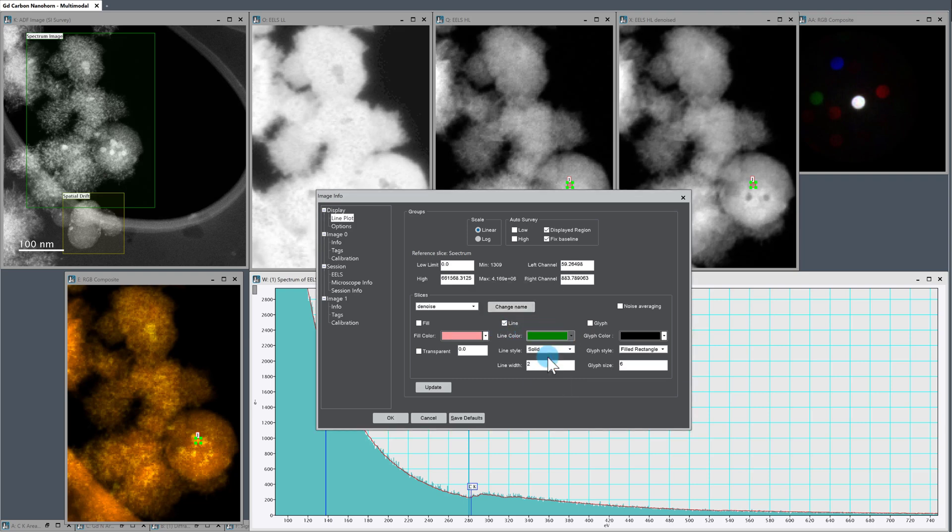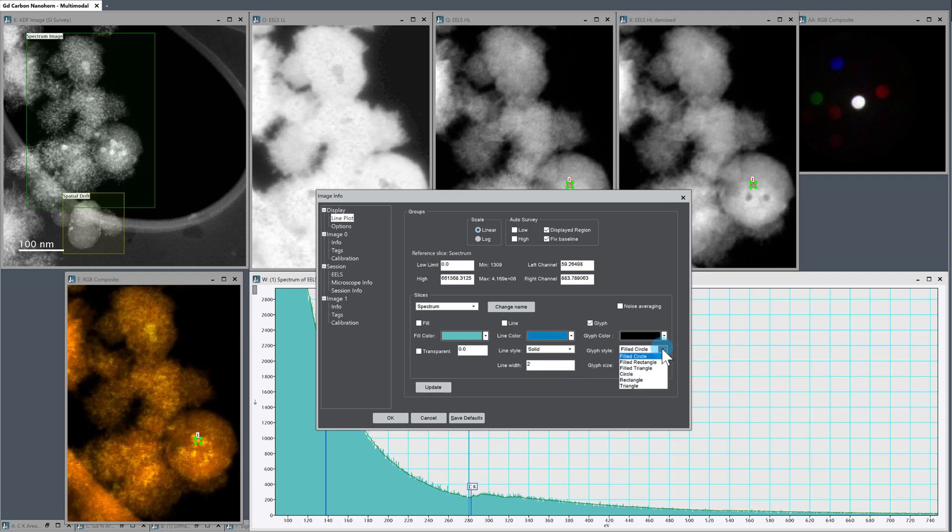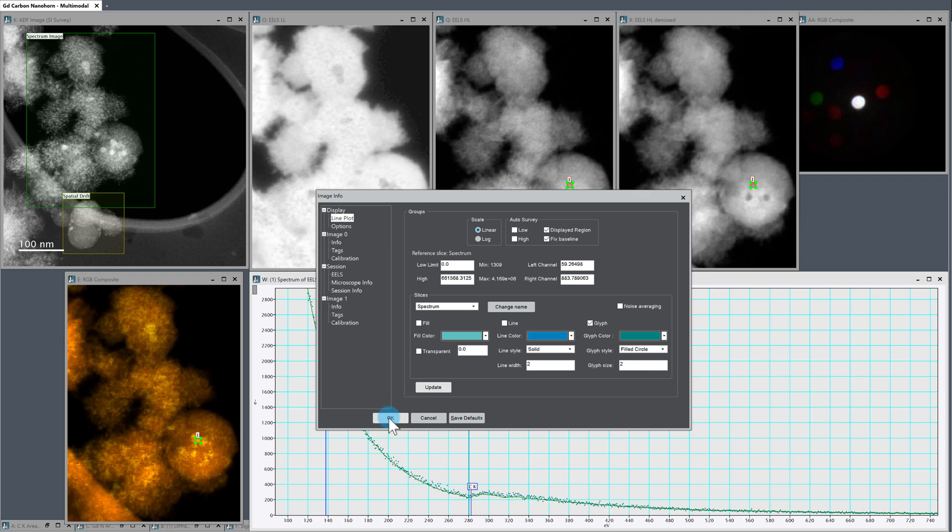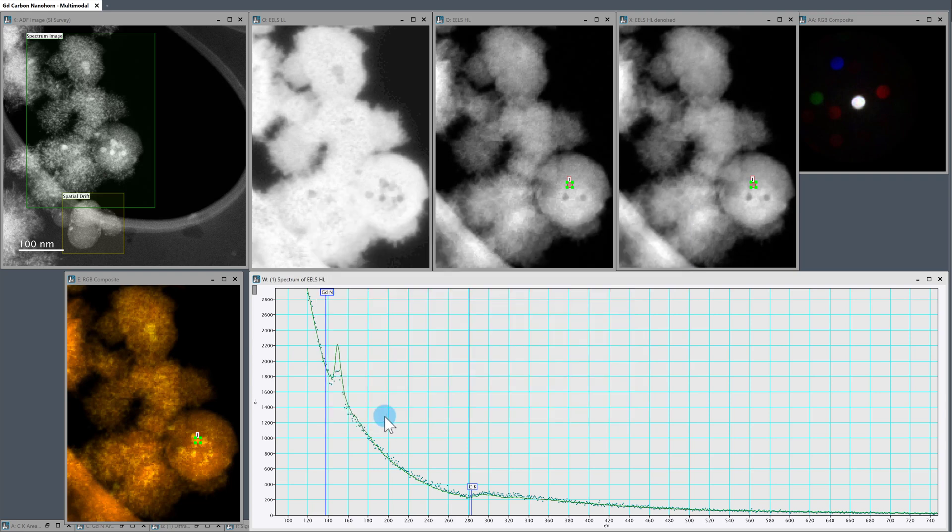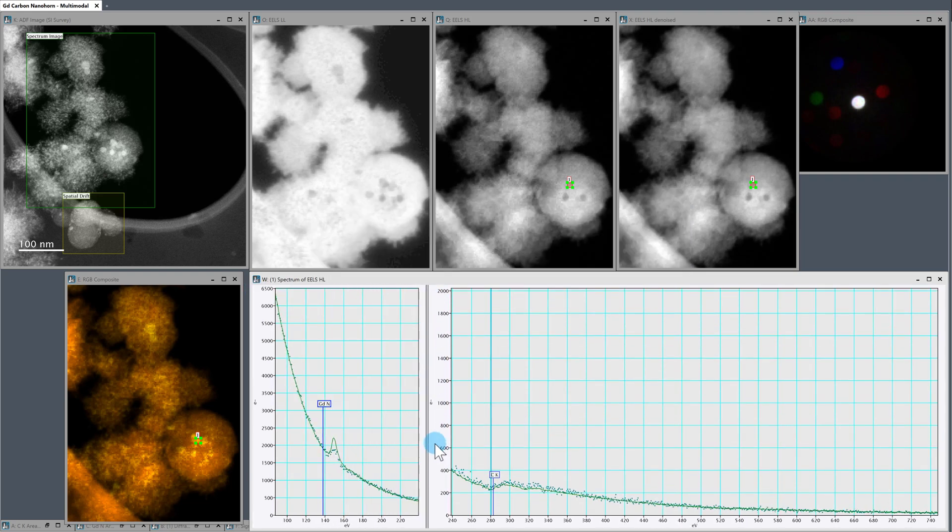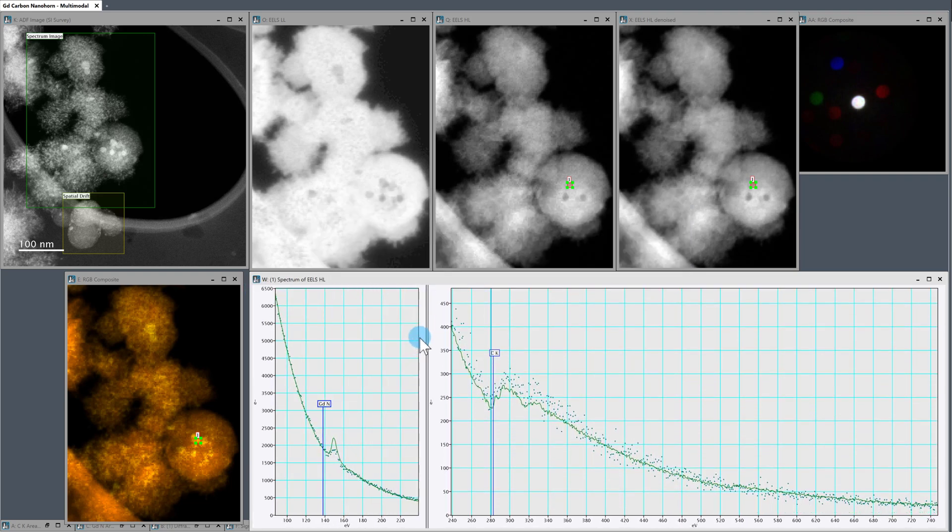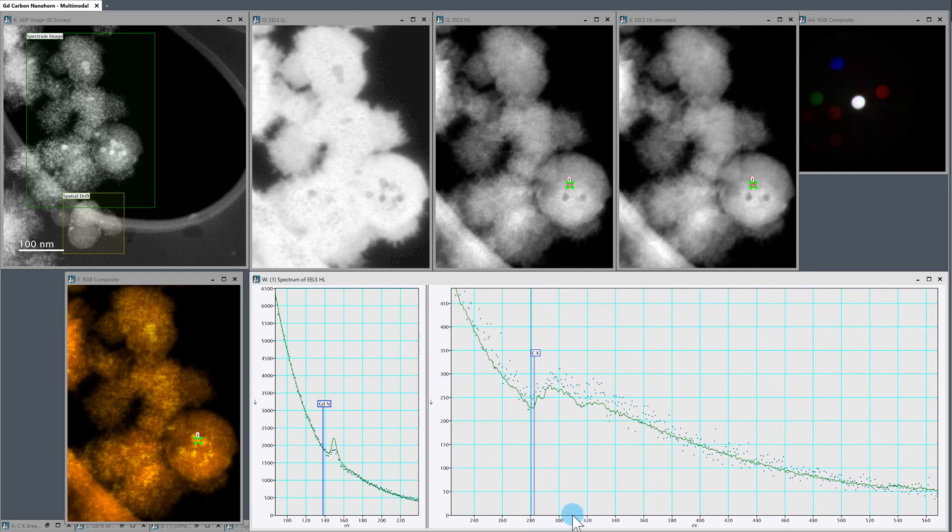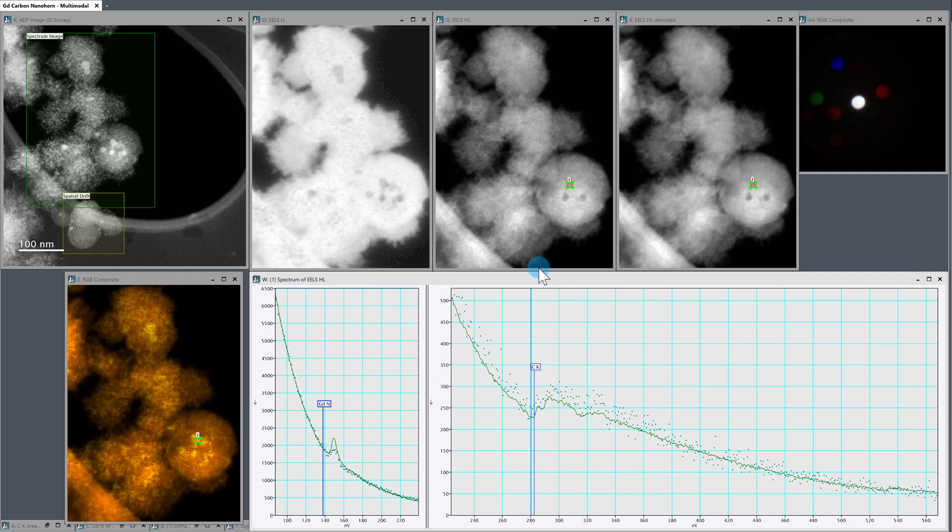So I'm going to make it green and update. And then the spectrum, I like to make this glyph. So we're going to make that two filled circles, and this color update. So let's zoom into our carbon. So it kind of helps you guide your eye and look at the potential edge shape, while still retaining the raw data.